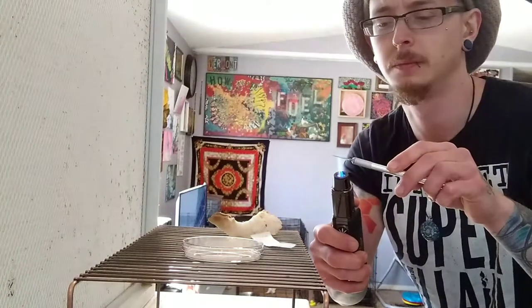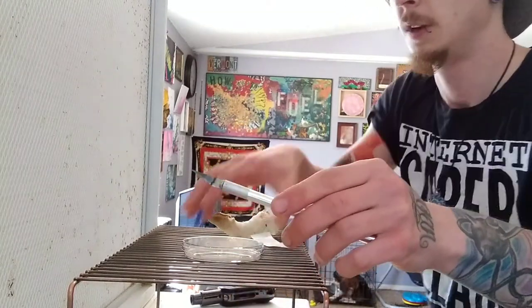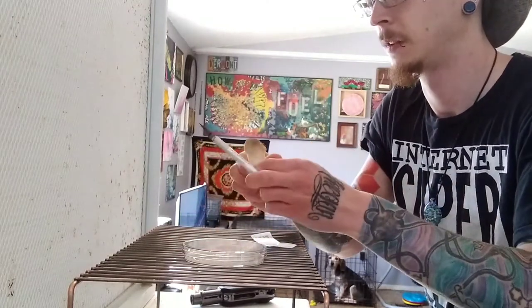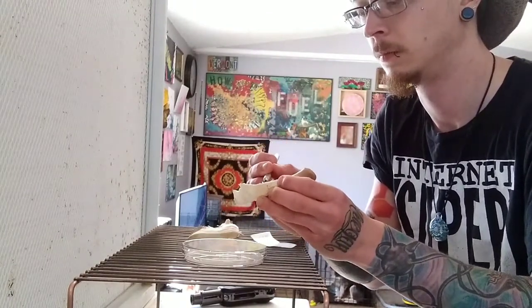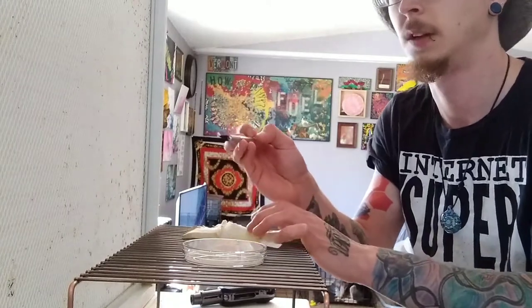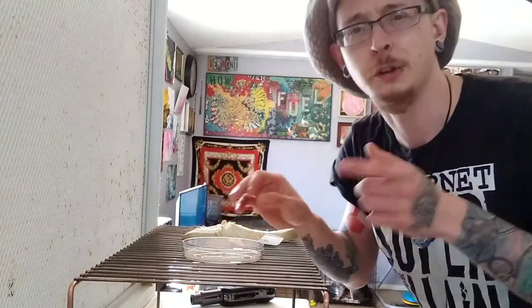We have our torch, we have our instrument, and we're just going to get that red hot in front of the flow hood. Then what we're going to do is just dip that in to pull it off. There we have our little piece of tissue.